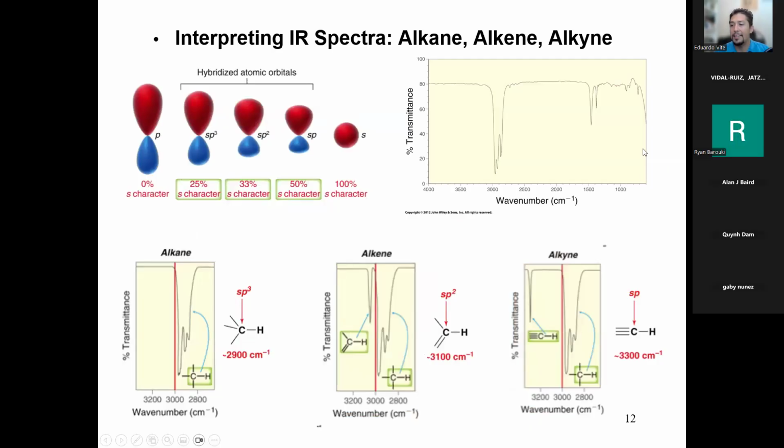This is it. Now we're getting into the details. We have the theory behind us. We've explained that molecules vibrate in all sorts of different ways. We've been telling you that there are functional groups that are vibrating. Now let's actually look at what those vibrations and peaks look like. So let's start with the most basic type of molecule, a carbon-hydrogen only hydrocarbon molecule. You can have single bonds, alkanes, alkenes, double bonds, or alkynes, triple bonds, right? All kinds of hydrocarbons.